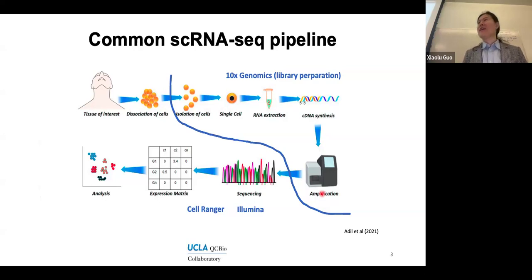Yeah. So because each cell only has 1 picogram of mRNA, and the capture rate is only 5 to 30%, which is even less, and the detection threshold is usually 0.1 to 1 microgram for the sequencing core. So to reach that threshold, we need to amplify it. That's why we do the PCR.